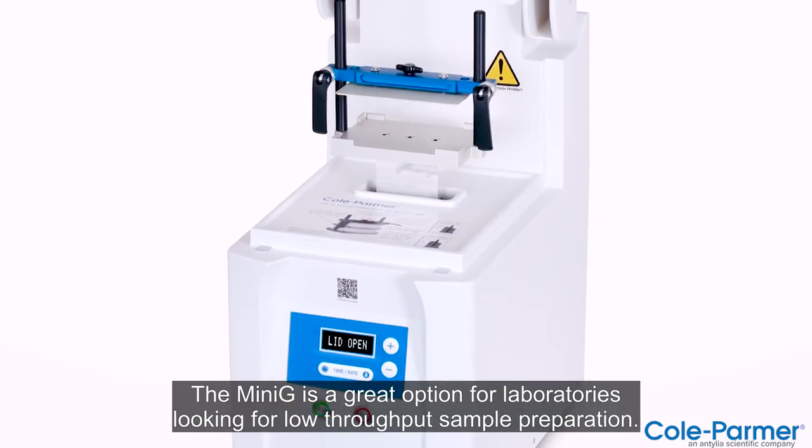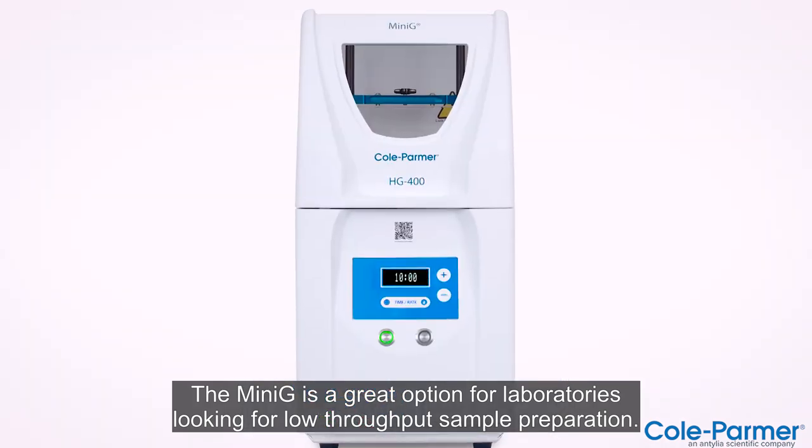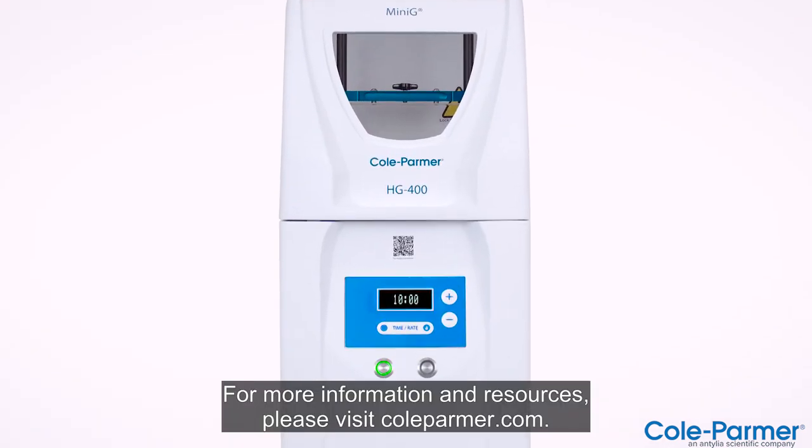The MINI-G is a great option for laboratories looking for low-throughput sample preparation. For more information and resources, please visit ColeParmer.com.